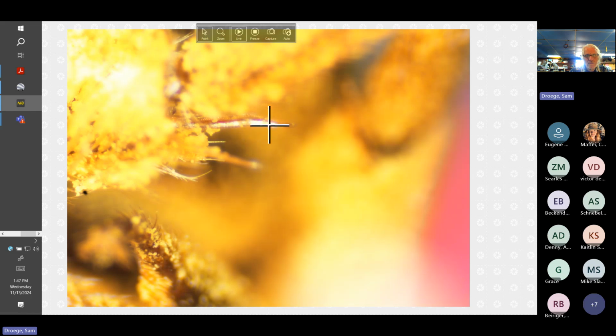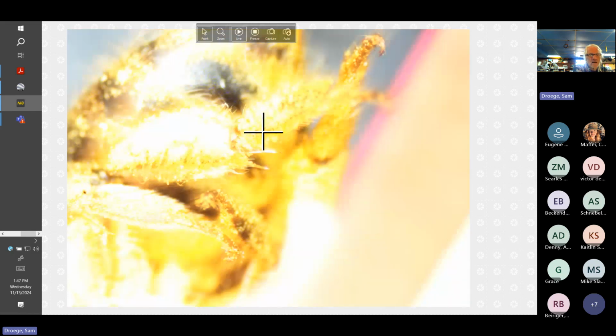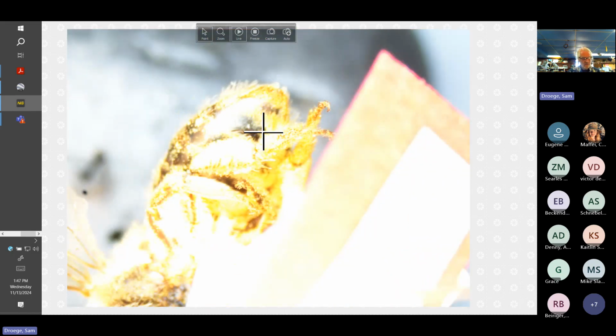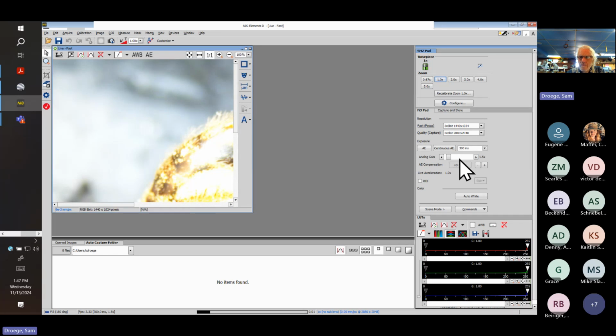This line not tapering equally. And it looks like there is a very slight kink in there. And if we look from the other direction, it's also curved. But I'm just telling you that it is not an easy lift to see that thing. I'm going to go back and drop the lighting down.